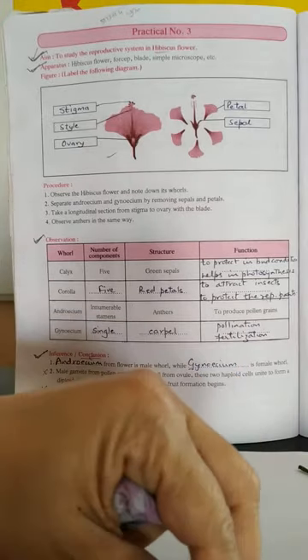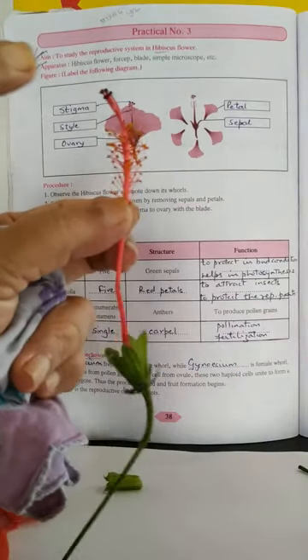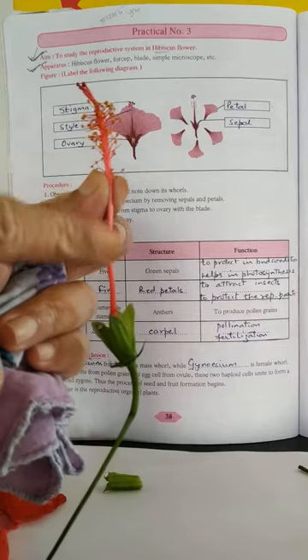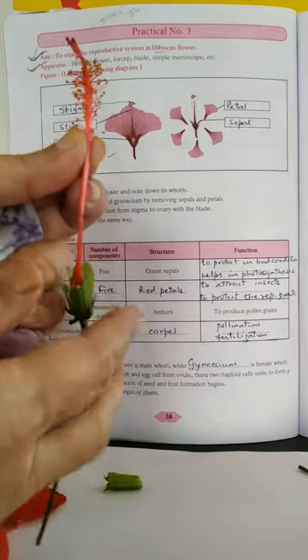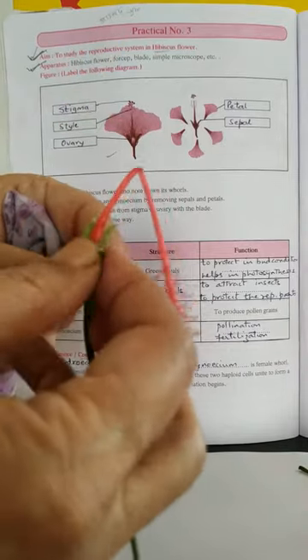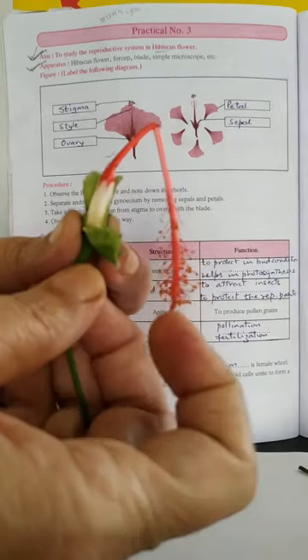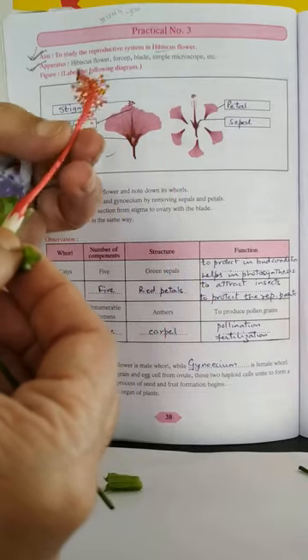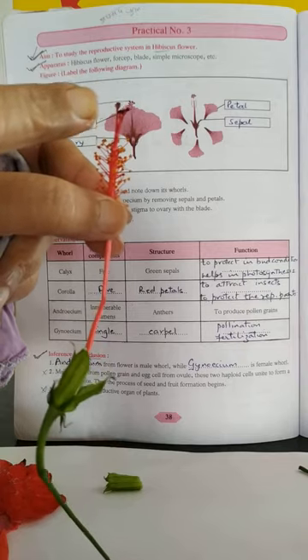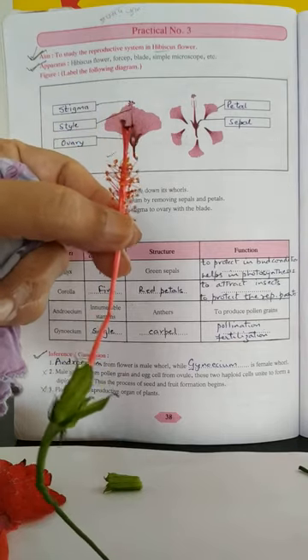Now I'll show you. This is the center one, the gynoecium, that is the female reproductive part. The basal part, the swollen part is called as ovary. This part is called as ovary. This is style, and the upper one bifurcated little swollen part is called as the stigma.